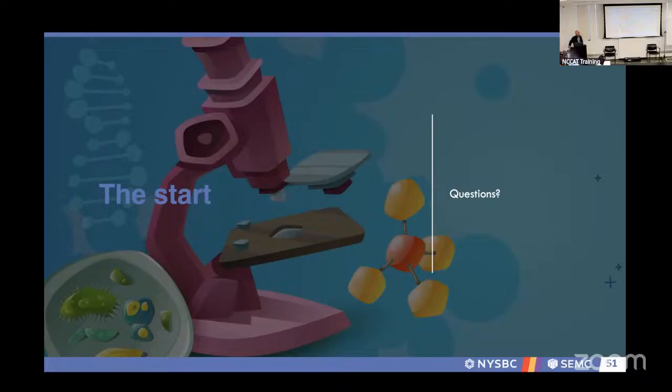In truth, for modern detectors and most microscopes, they're all really good, and you'll be able to reach the resolution you want. But if you want to do that accurately, you can calculate the MTF and DQE of each detector, and you can compare them, and they have differences. There's a difference between theoretically what would be the best DQE and the best detector, and then practically in terms of when you're doing data collection.